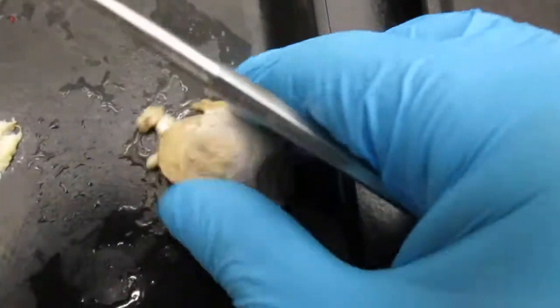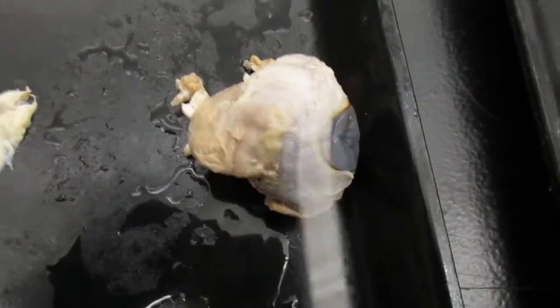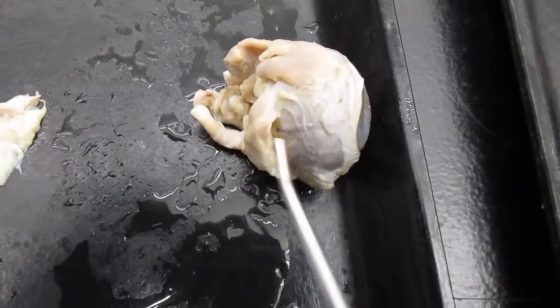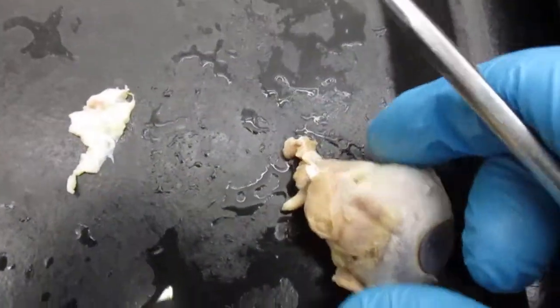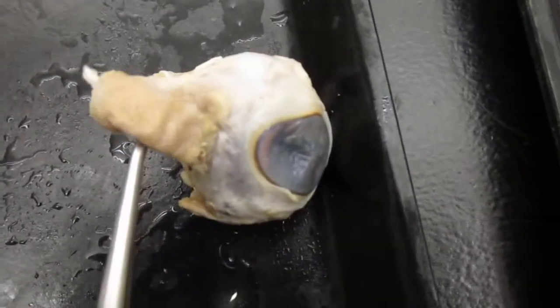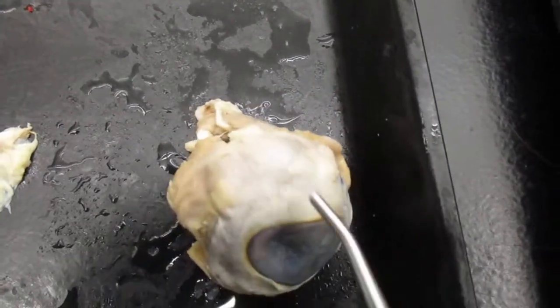Okay, if you look right here, we can see an extrinsic eye muscle right there. Here's an extrinsic eye muscle here. Here's one. Here's one. Here's another one. So hopefully you see that. So all this stuff right here is your sclera, the white part.